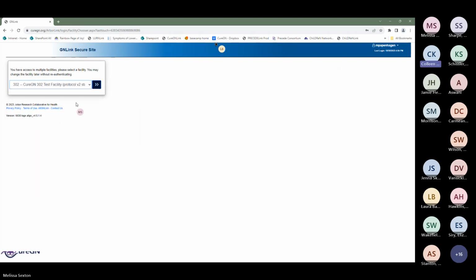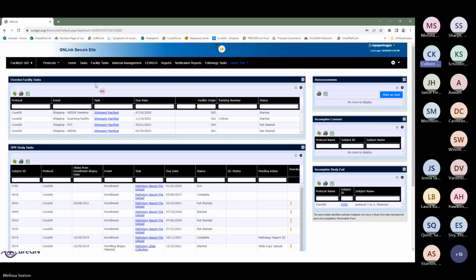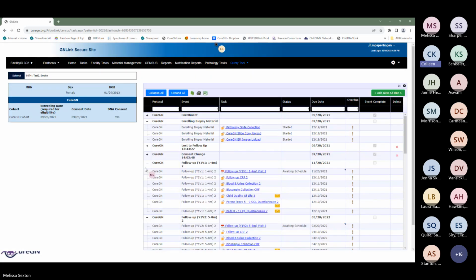When they have failed that, it has always been two things. One, there's a problem with the manifest. So the manifest you email them does not in some way match the material they receive. And we've had both: there are more slides in the box than on the manifest, and there are fewer slides in the box.